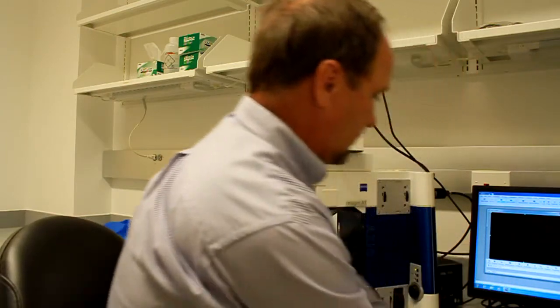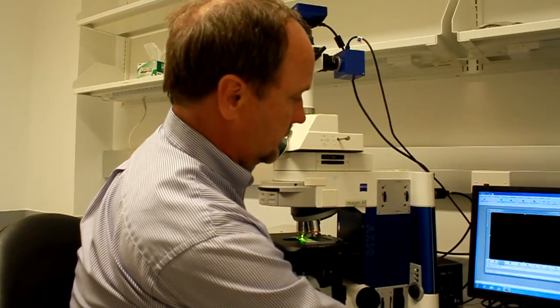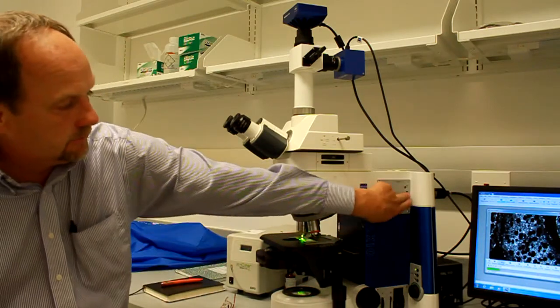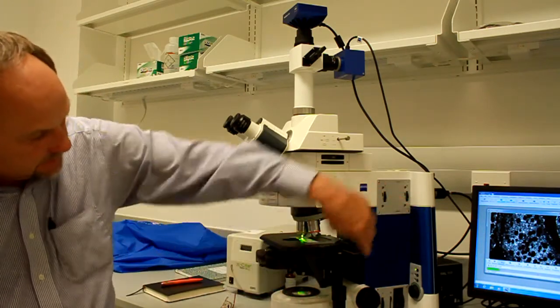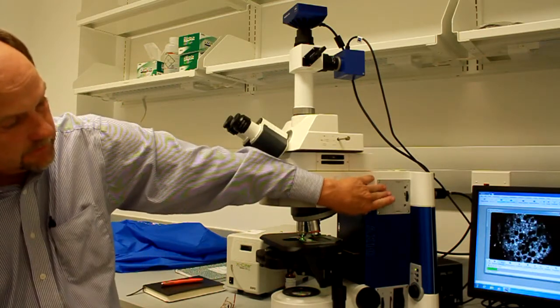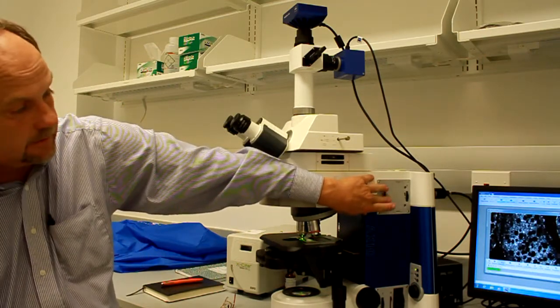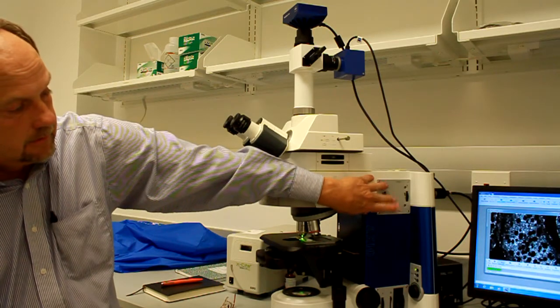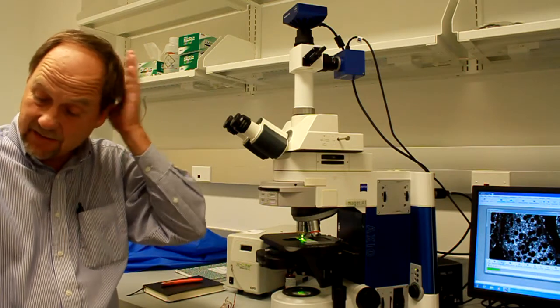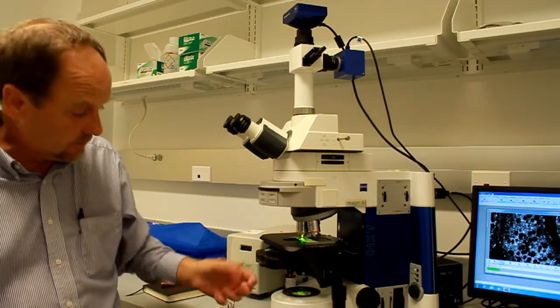Now we'll have to start talking about the software a little bit. So now these two irises are similar to the ones underneath. F is field iris, so if you look there, it's closing down that field iris, right? And the reason why you'd want to close that down in this case, there is no condenser to adjust, right?